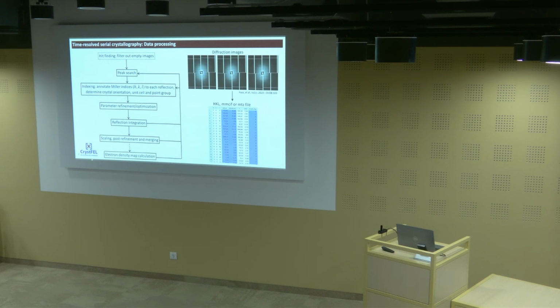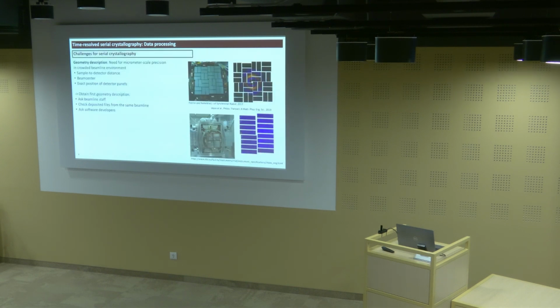So I'm mainly using the program CrystFEL, so this is mainly how this is done in CrystFEL, but other programs such as DIALS and cctbx will follow a very similar scheme. Good. Some challenges that we face in serial crystallography. There are several of them, so I just selected a few.